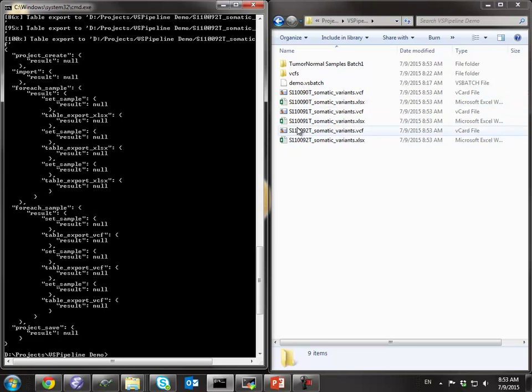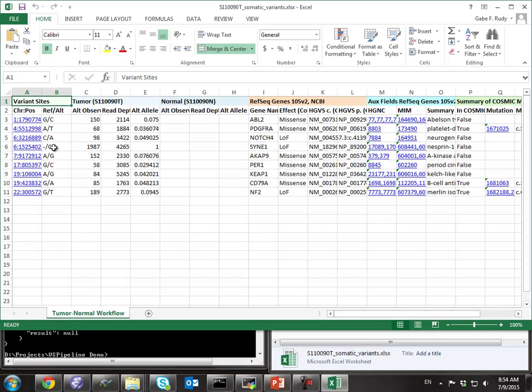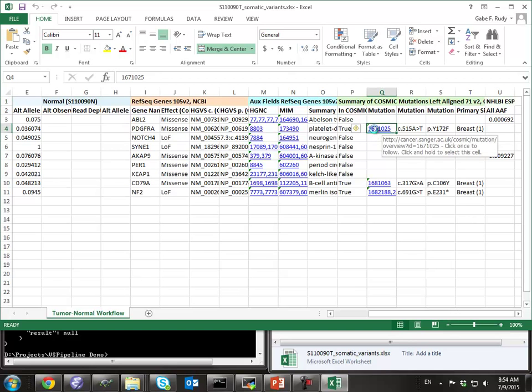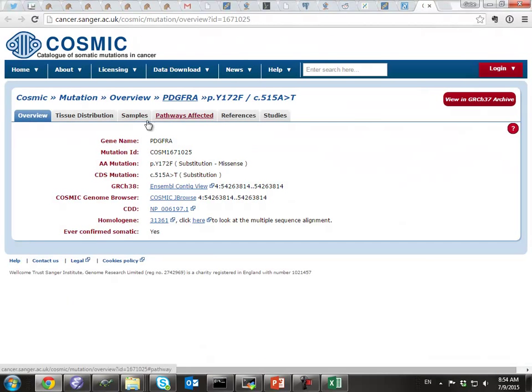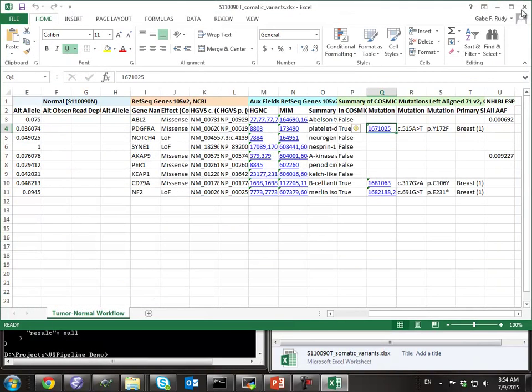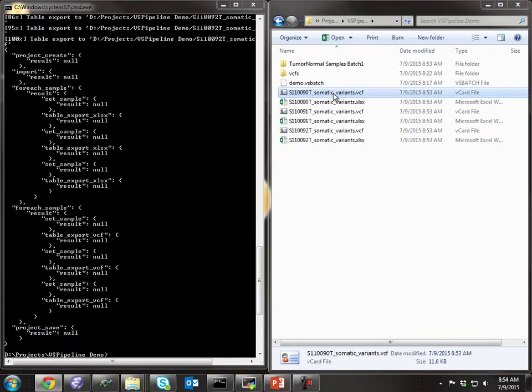The first thing to notice is we have these great deliverables — three tumor-based sample Excel files. These are filtered down based on my workflow, and I have all these great hyperlinks, information about the variants, the gene, their effect, HGVS notation, information from Cosmic. You can click on these hyperlinks and it brings you right to the Cosmic IDs.